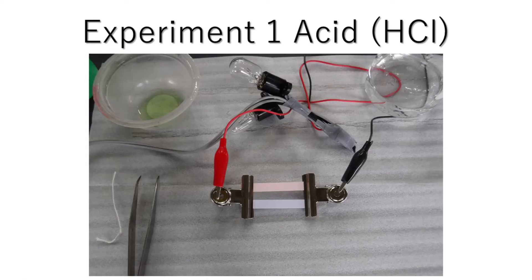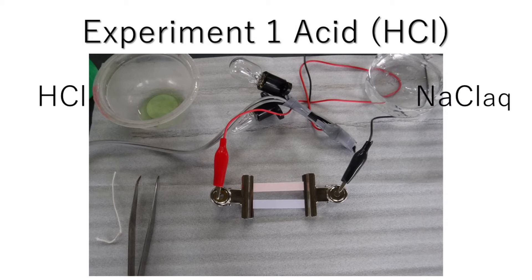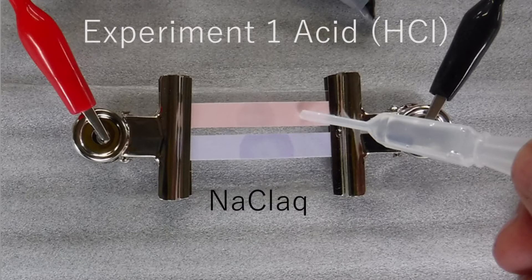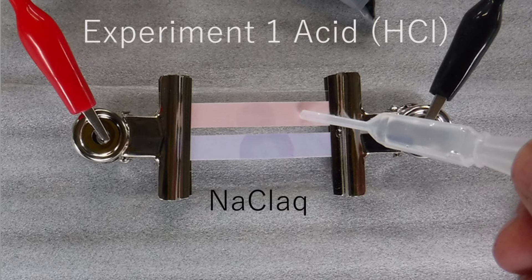Let's do the first experiment with hydrochloric acid. Red and blue litmus paper are used. Salt water is applied to the litmus paper as a neutral electrolyte solution.